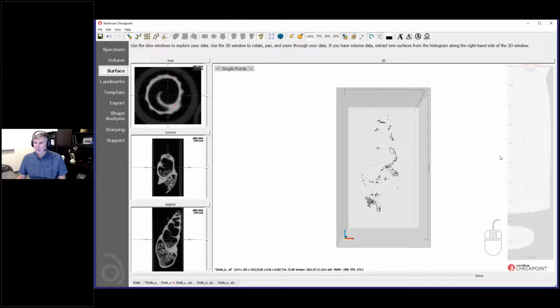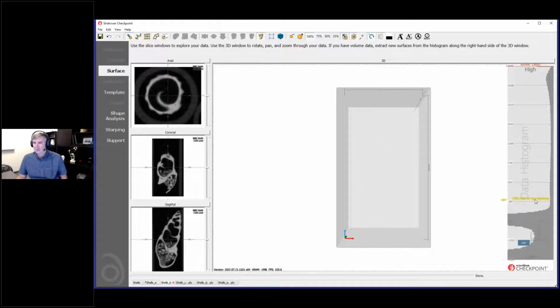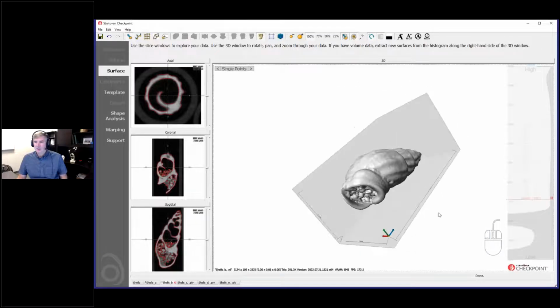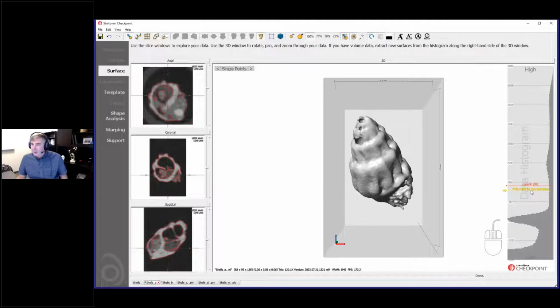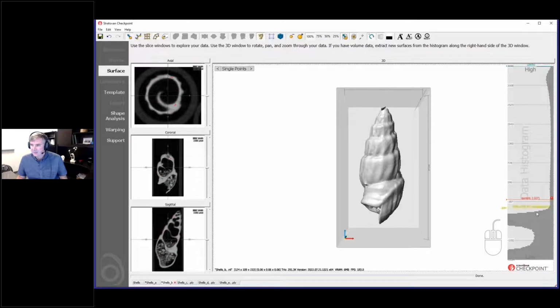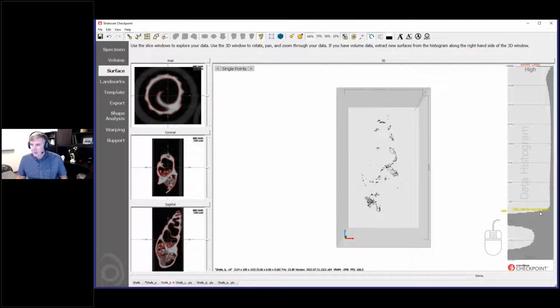So look at this one. This one picks some weird value. So let's pick another value down here. One thing you may want to do is use the same value across your specimen. So in this case, I used 92 for my ISO value. In this case, this is minus 327. So I'm going to close that. I'm going to go up to 92 or as near as I can.